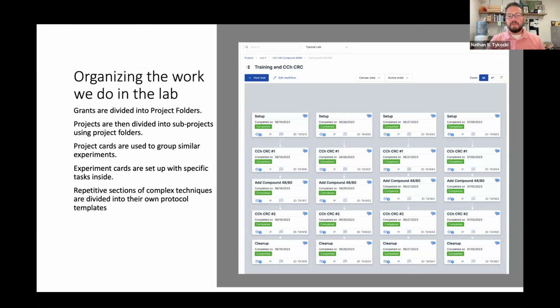The reason that also ended up useful is that if we're doing other experiments where we're adding, say, the same antagonist to an in vivo experiment or a pressure myography experiment, we don't again have to reinvent the wheel of the protocol. We just pop that in from this other plan.